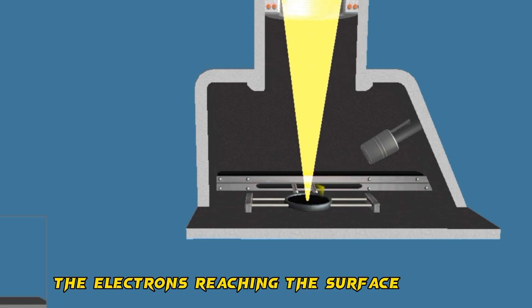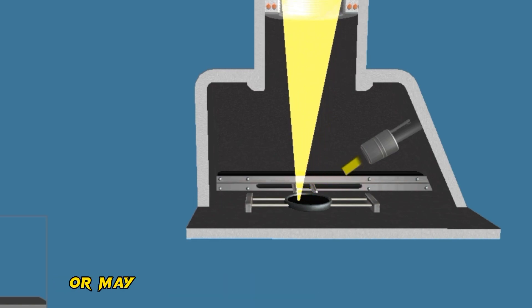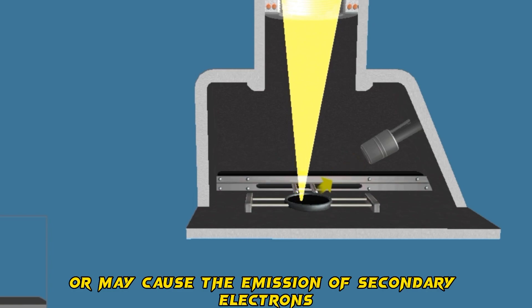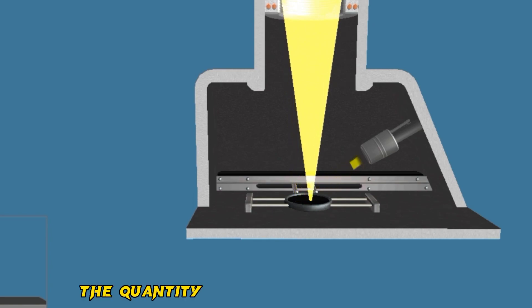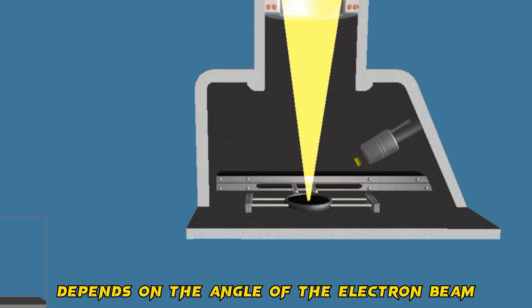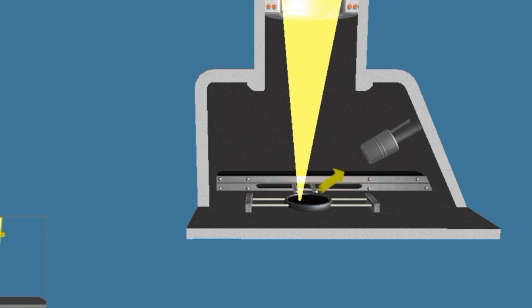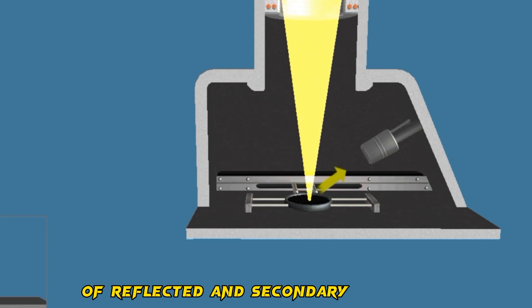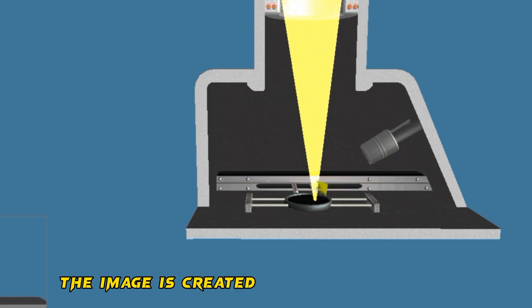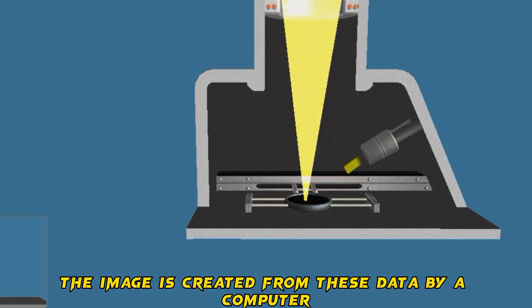The electrons reaching the surface may be reflected or may cause the emission of secondary electrons. The quantity of these in one direction depends on the angle of the electron beam and the surface. The detector measures the quantity of reflected and secondary electrons. The image is created from these data by a computer.